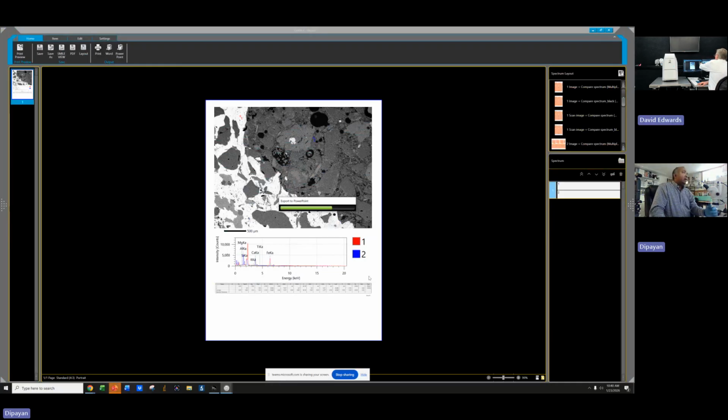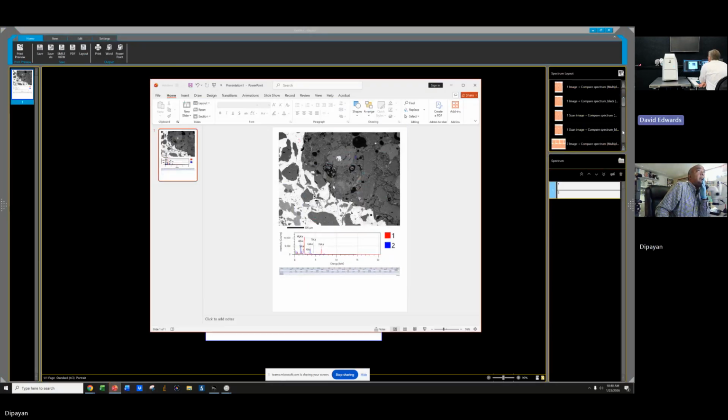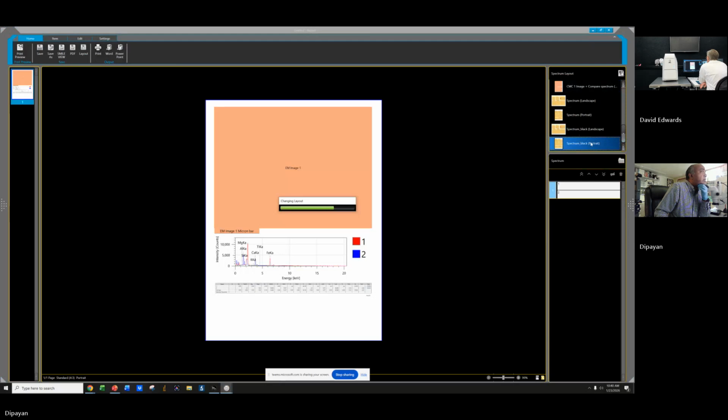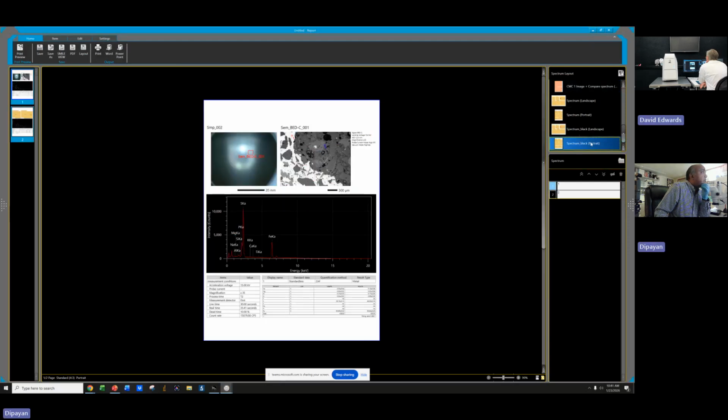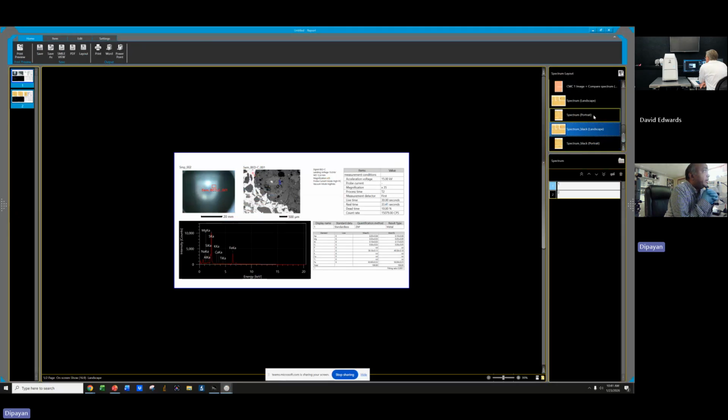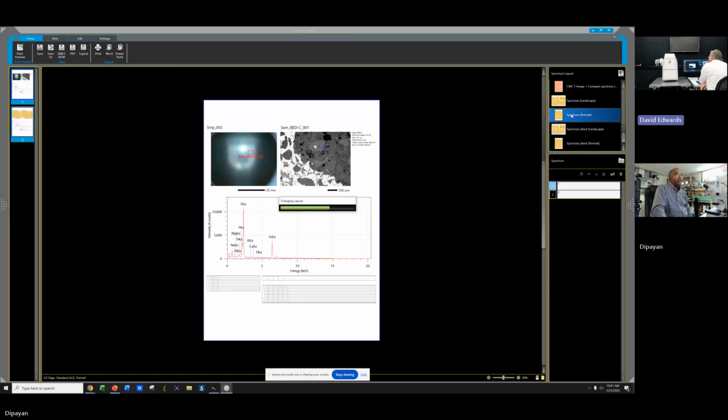Why wouldn't you just, over on the templates on the right, scroll down, and then choose one of the yellow ones. Oh, yellow ones. Yeah, they're orange, right? These are yellow. So pick one of those. You just gotta wait for it. Probably the one above that one. Two up. The next one. Okay, that one. Did you click it? I don't see anything. I thought I did. That's the one you want. There we go.